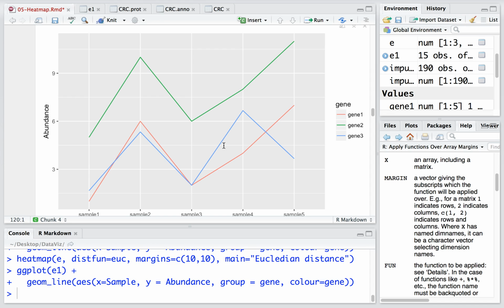So in this case, we need to consider the pattern of the proteins, whether they follow the same pattern. If you are really interested in the patterns of different proteins or genes or even peptides, and most of the time I think it's peptides, like for the same protein in protein quantification, we probably only want to keep the peptides which have the same pattern.